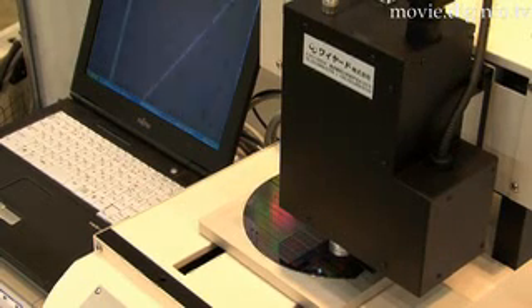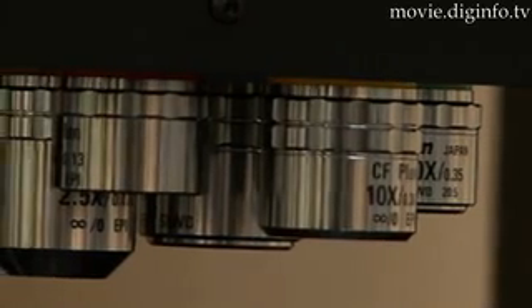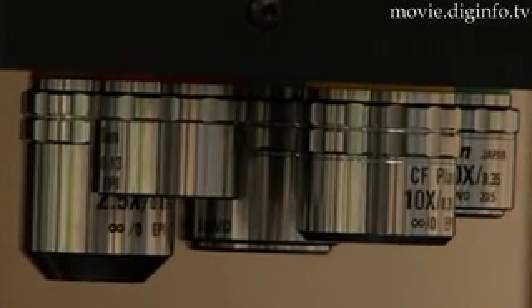The LSAF has a maximum of 5 objective lenses with 2.5 to 50 times zoom magnification capabilities.